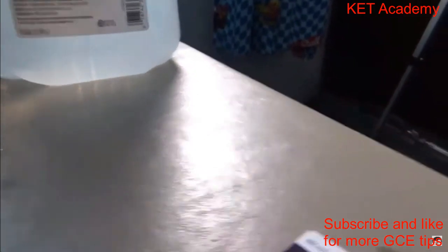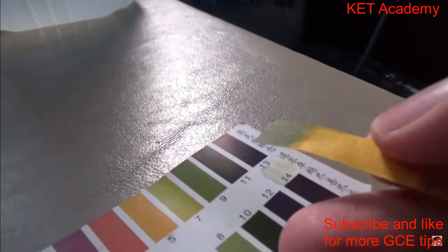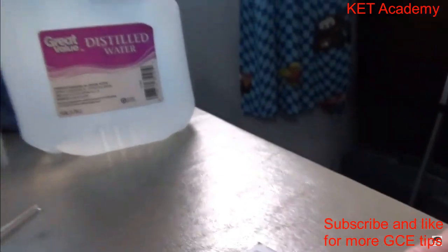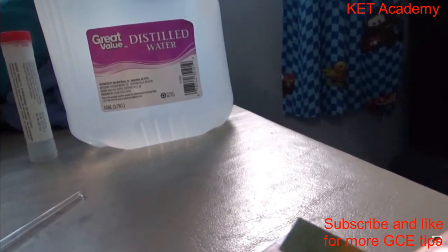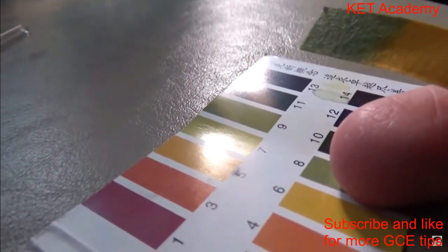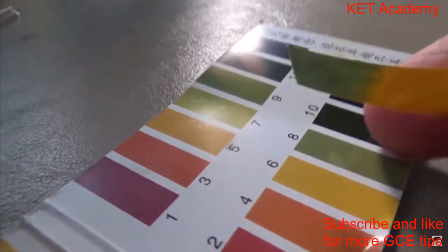You know what? That looks pretty close. That's like a 10 or 11, and according to Google, 11.5. So honestly, my guess, my money is on potassium carbonate right now. So my initial hypothesis, actually.